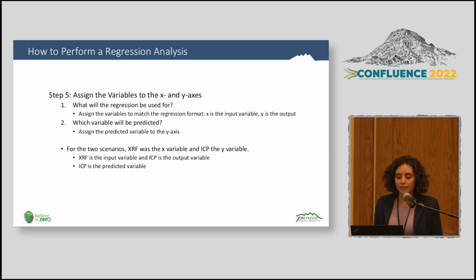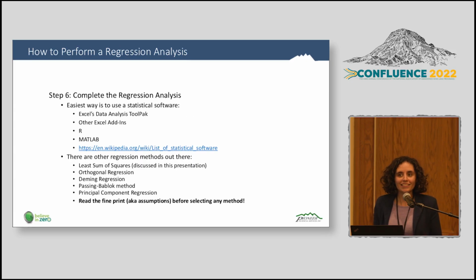So step 6 is complete the regression analysis. This is the easy part. This is where you let the computer do the work. I mean, if you want, you can do it by hand, the math isn't too terribly difficult. But there are some statistical tools available to you. Excel's data analysis tool pack, which comes with Excel, is pretty easy to use. There are other Excel add-ins you can download online.